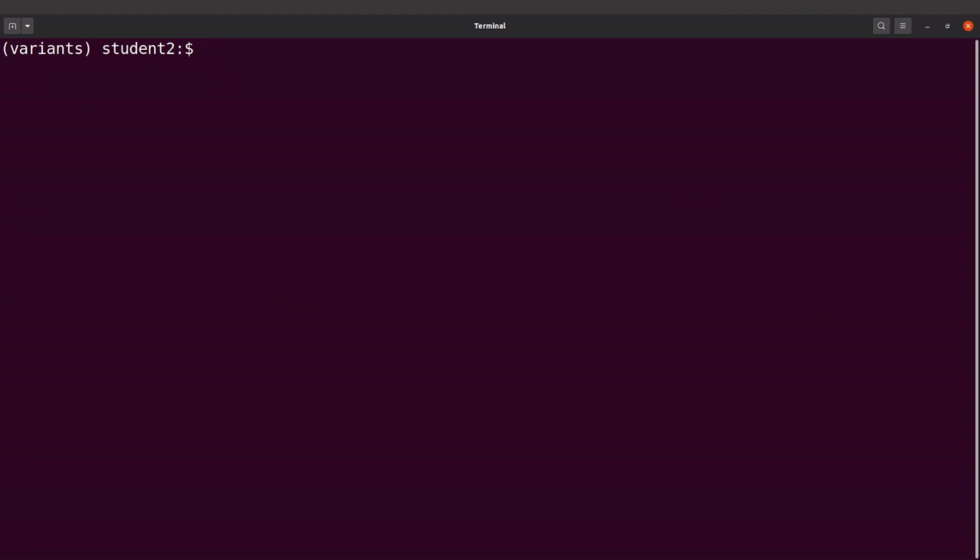So we will run FastQC. We say fastqc data/fastq/raw reads/*fastq.gz. FastQC will start the analysis and then give us the results.